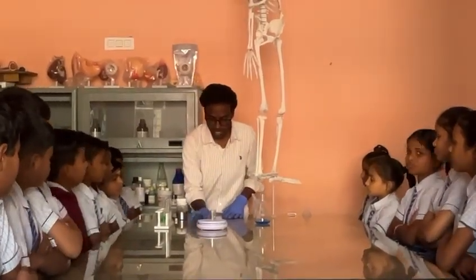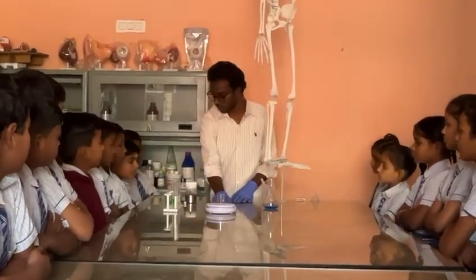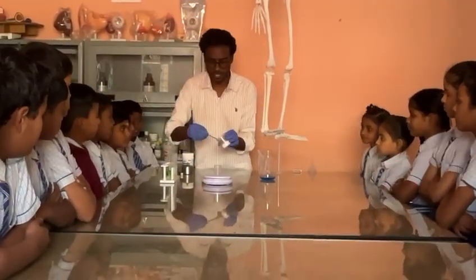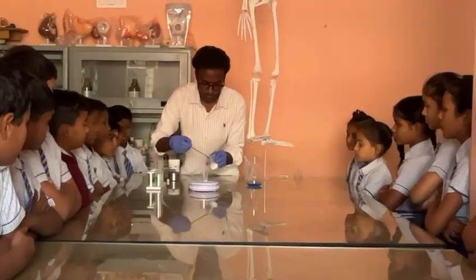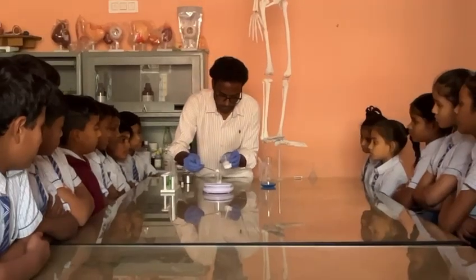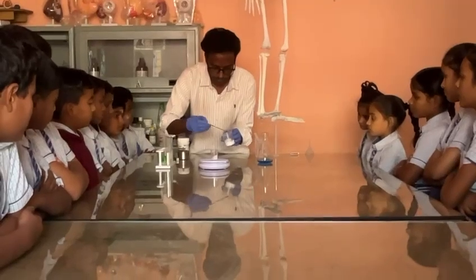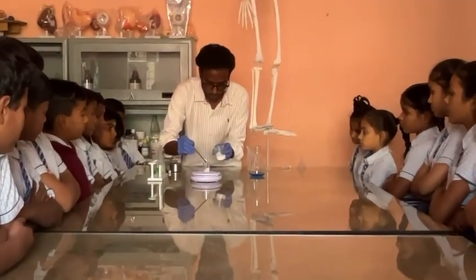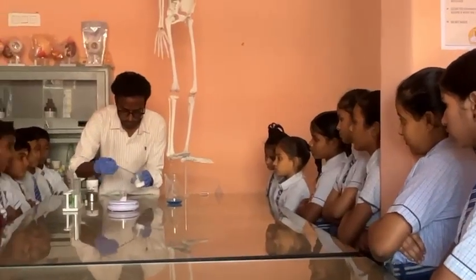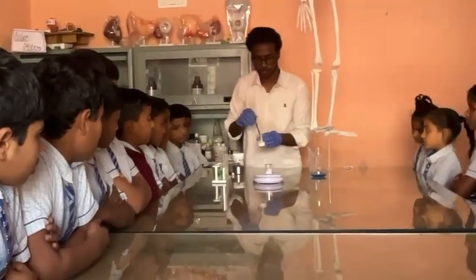Now when I keep it, we have to make it tare. Tare means we have to make it 0 again. Now it is 0. What is the reading now? 0. We'll take some 10 grams of salt.